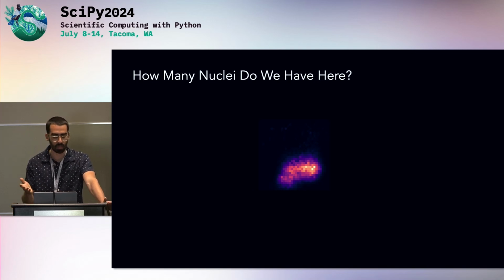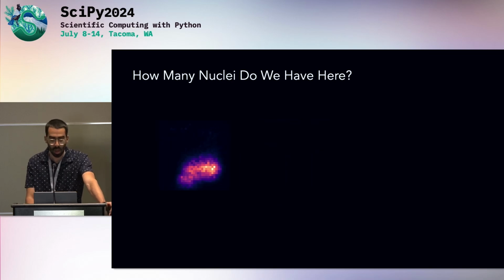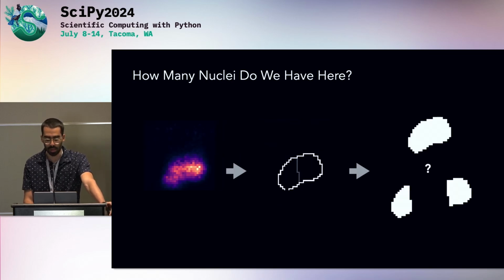So we have here one image. It looks like maybe it's 1 nucleus, maybe 2. It's hard to tell. For me, it looks like a single nucleus. But our idea here is to have a contour representation that tells the likelihood, or at least is proportional to the probability of being a cell boundary.